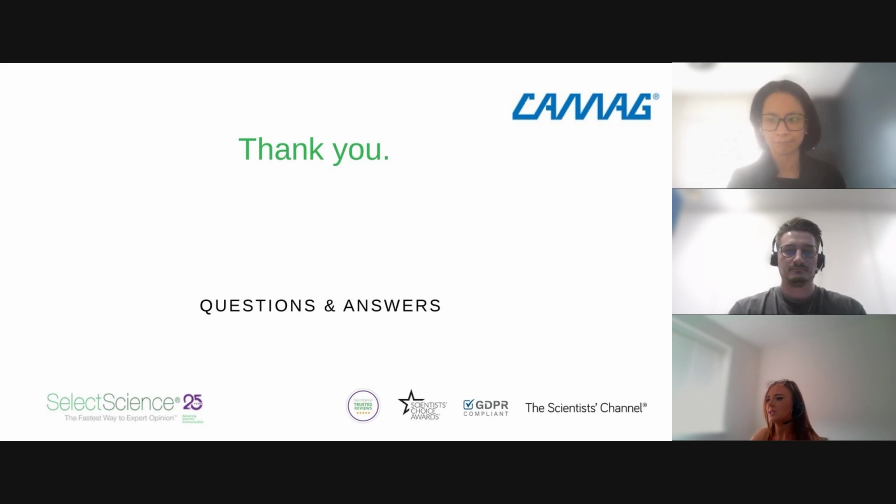Perfect, thank you. And we've got time for one more question, and this is, are the peak heights coming from scanning densitometry or from profiles generated from images? So yeah, I will take this one. The peaks are coming from the profile generated from the image. So we don't have to do the scan step.